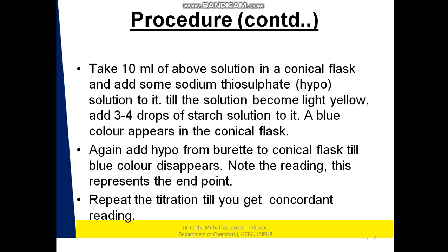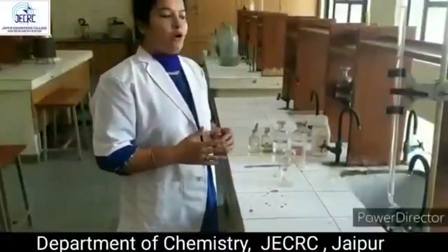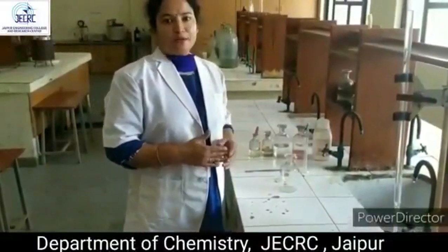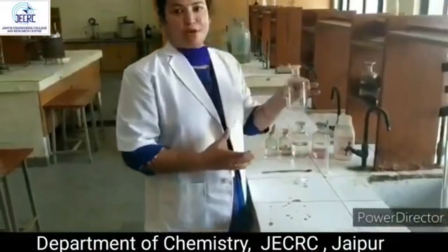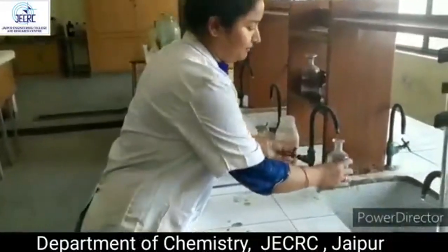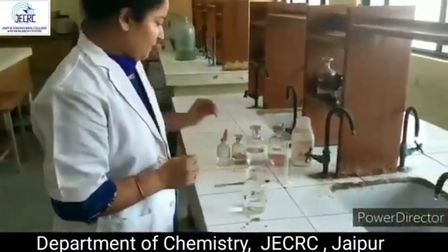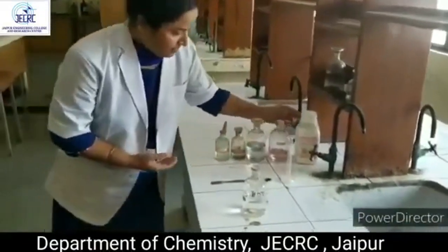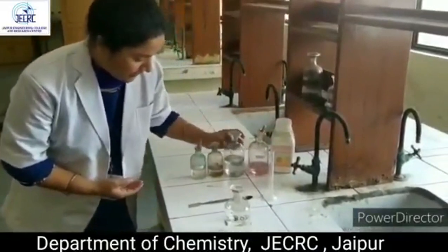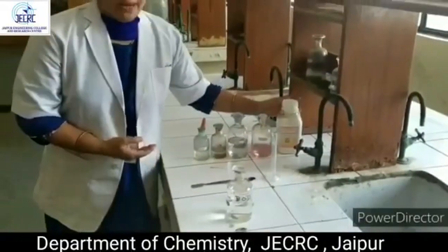Now we start our experiment in the laboratory. Now we will start the experiment for calculating dissolved oxygen in the water sample. This is the BOD bottle. In this we will take the water sample, 300 ml. So we will take 300 ml tap water, and then these are the solutions: manganese sulfate, KI solution, azide, starch as an indicator, and NaOH pellets.